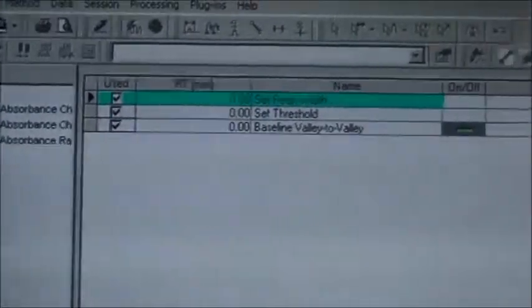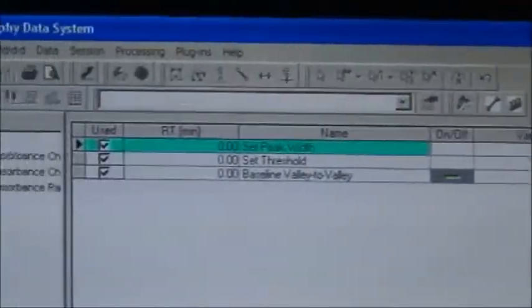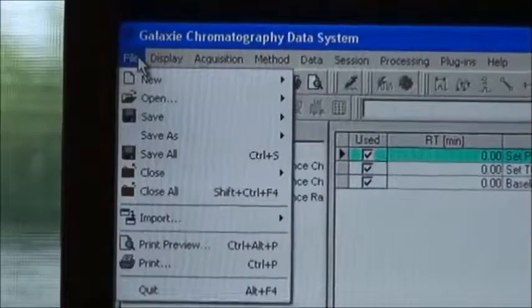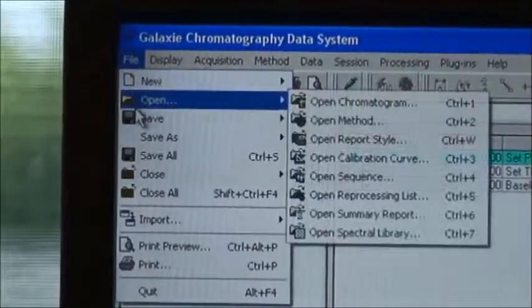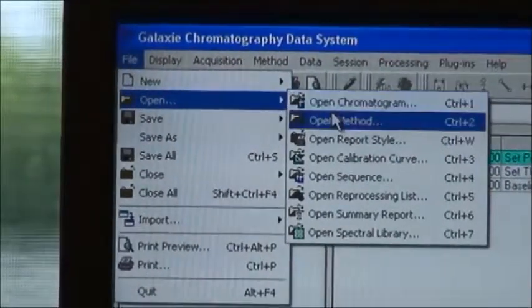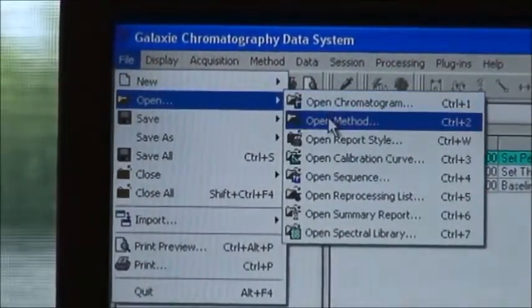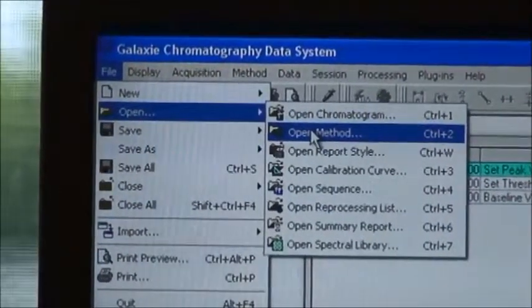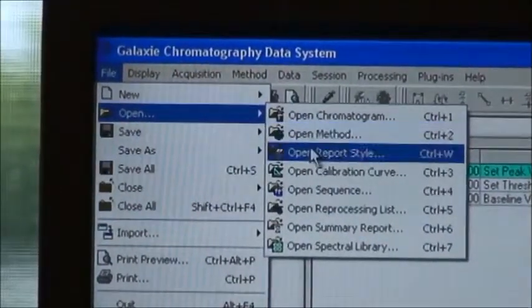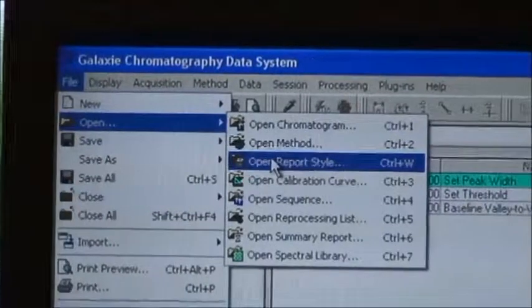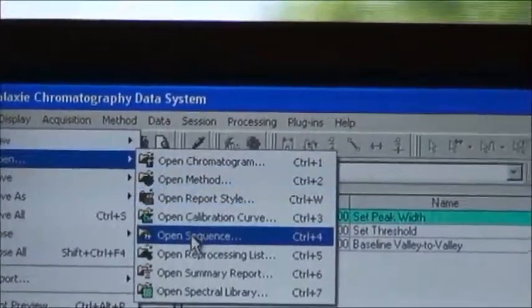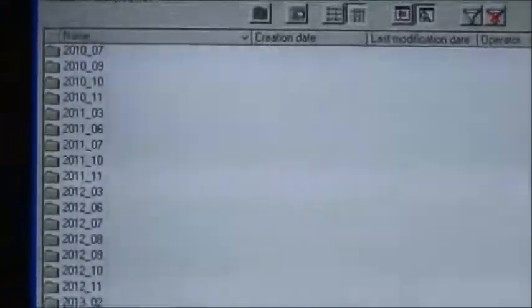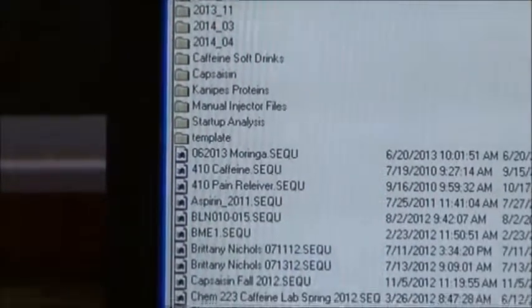The next thing we need is the sequence file, which I have already prepared in the system. I go over here and open my sequence — and this is my caffeine sequence.